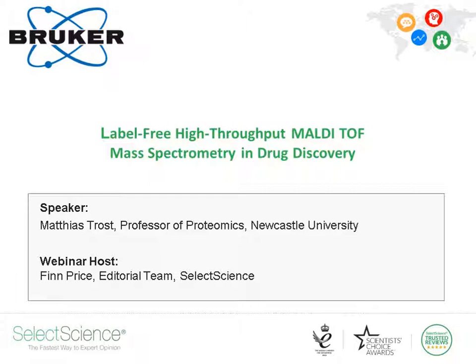This presenter will give you a current overview of label-free high-throughput MALDI TOF mass spectrometry and its use in drug discovery screening. Matthias will explain the basics of MALDI TOF mass spectrometry and the benefits of label-free screening compared to current labeled approaches.